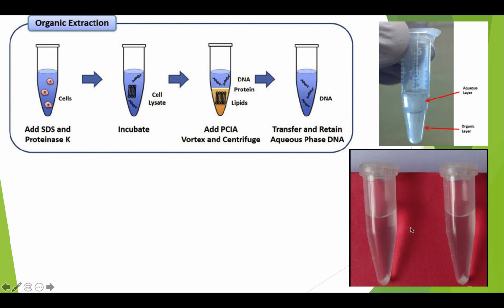Once you finish precipitating the DNA and centrifuging, this small pellet appears. This is what DNA would look like: a tiny small pellet. Sometimes it might not be visible, so be careful. And sometimes it might be loosely stuck to the tube, so when you flip the tube to dry it, the DNA might fall.